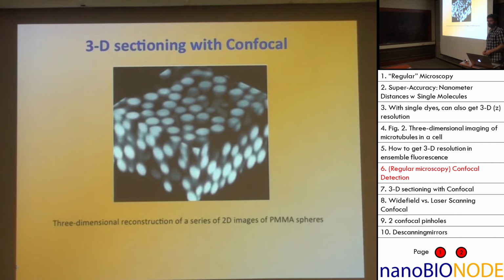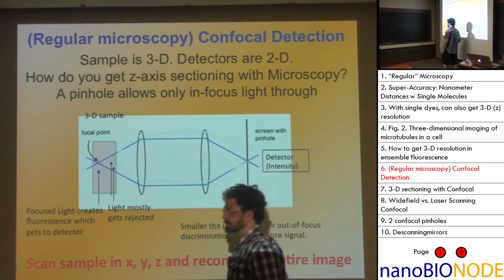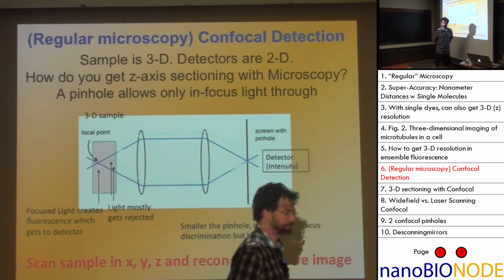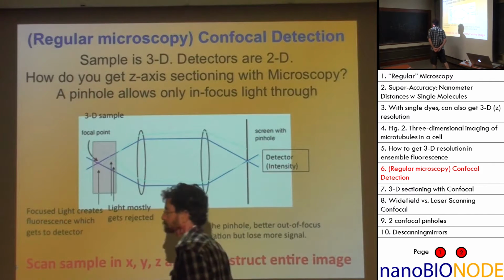There's a problem. Let's talk about photobleaching. Is photobleaching a problem with this? And if so, why? Why is photobleaching a problem? Because when you're doing all this, the sample is already being fluoresced. So if an area just gets photobleached, you miss that.